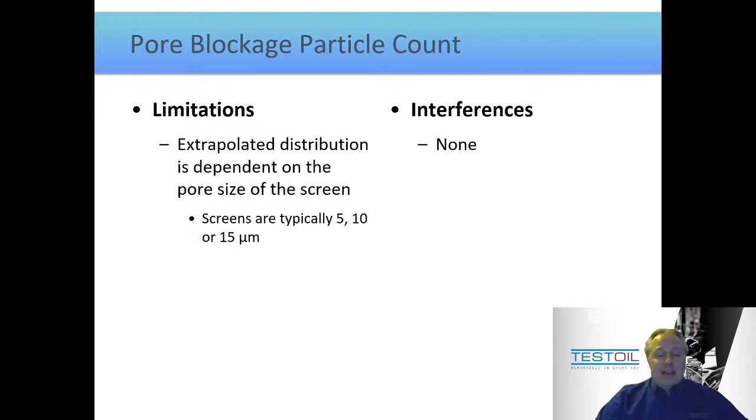So we don't need to dilute it, we don't need to do anything that might modify the particles that are in there. Because when you take a sample and you put it through sonication, if you sonicate it too long, you can actually break up larger particles into smaller particles and give a slightly different view of what's going on.